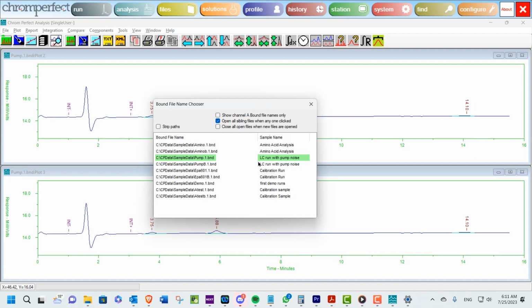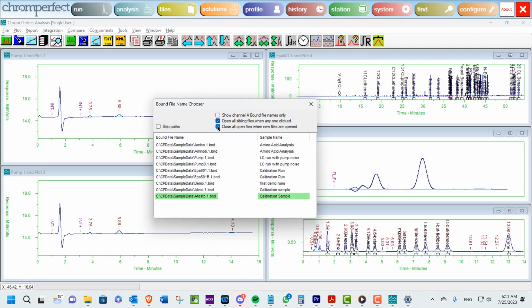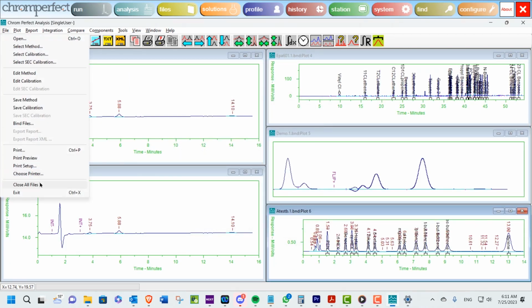channel as well. We use the term sibling files to refer to files that are part of the same multi-channel acquisition run. The usual way of opening files cannot identify siblings, but a sequence file, or XML list file, does have this information. By combining this feature with the Auto Tile and Auto Report features, one can quickly review all the chromatograms and reports, one run at a time.